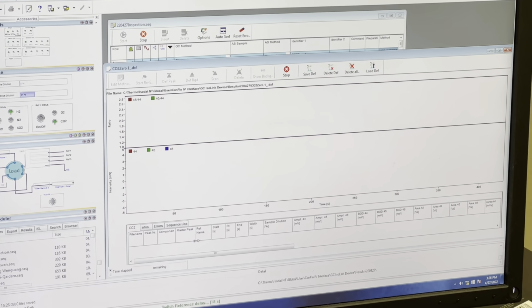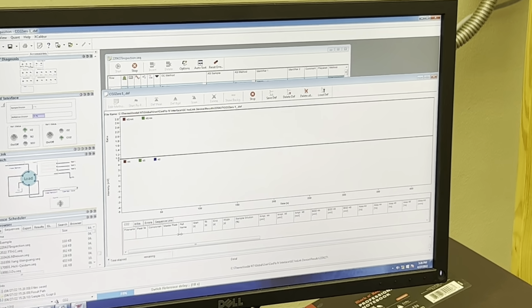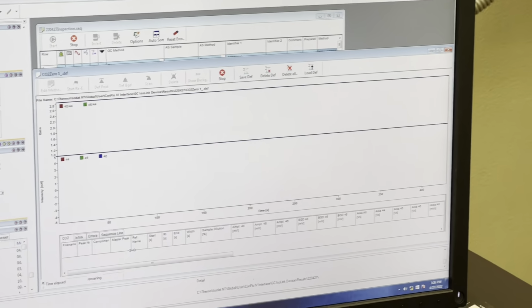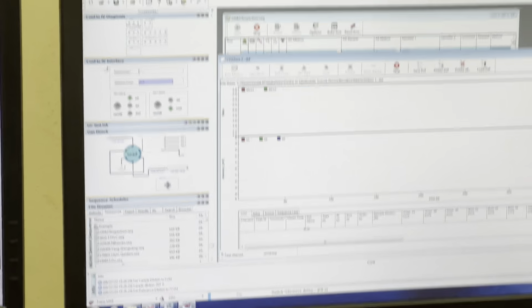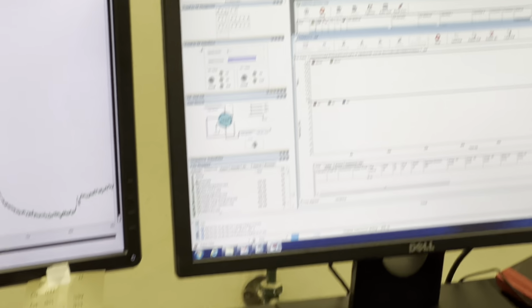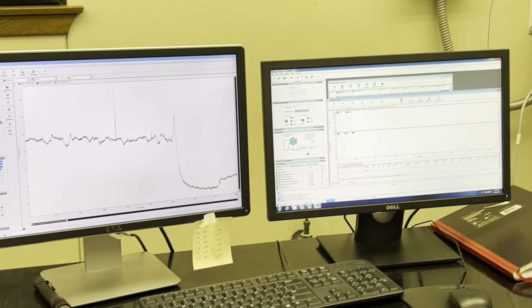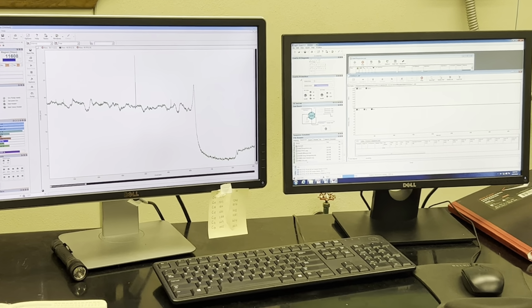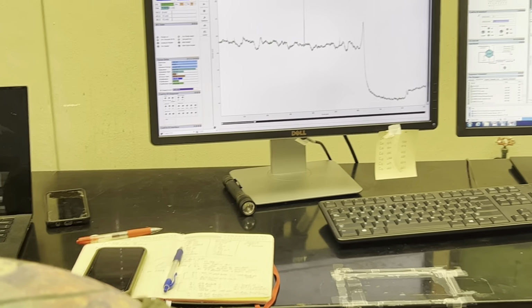It'll do its checks, peak center, and all that, and just do a bunch of zeros. Especially after a long time interval, I'd run quite a few just to make sure it's stable. I'm interested to see the peak shape and how bad the standard deviation is.